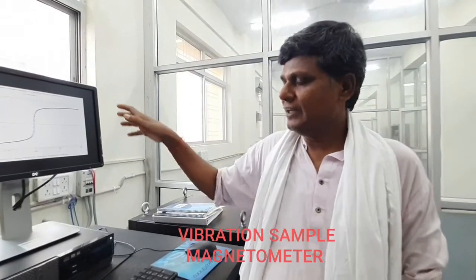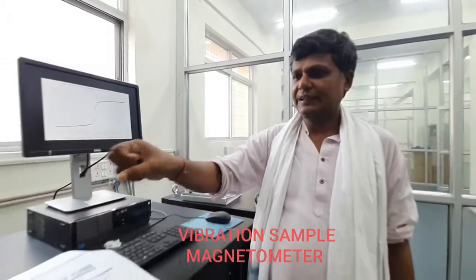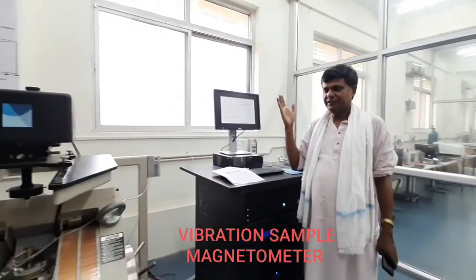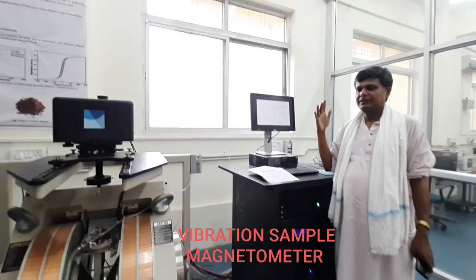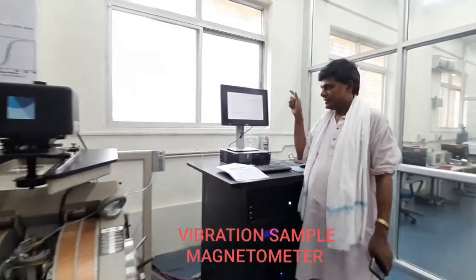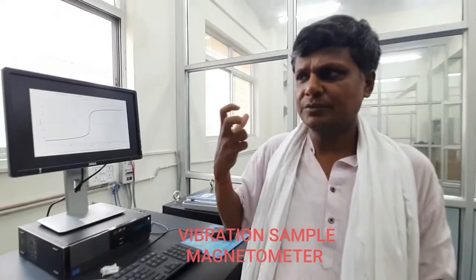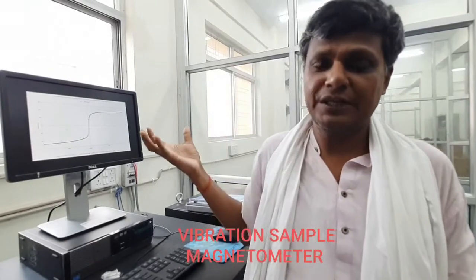Using this equipment you can get information about the retentivity, cursivity, magnetization, hysteresis loops, and other magnetic parameters which can also be calculated. For example, you can measure the Curie temperature also.